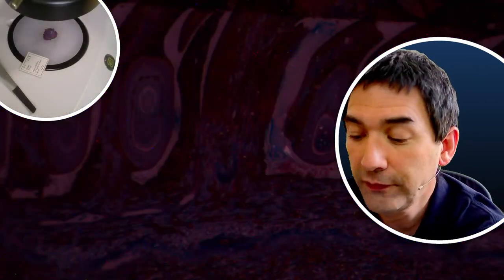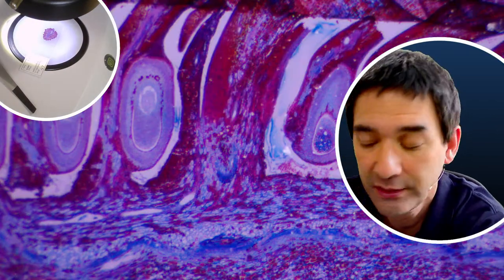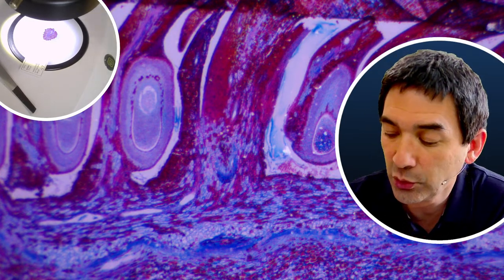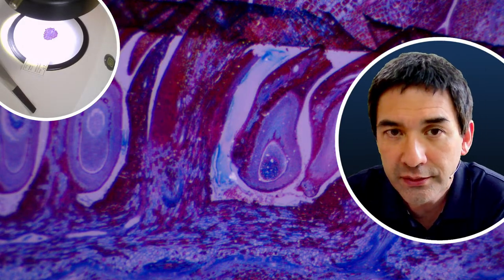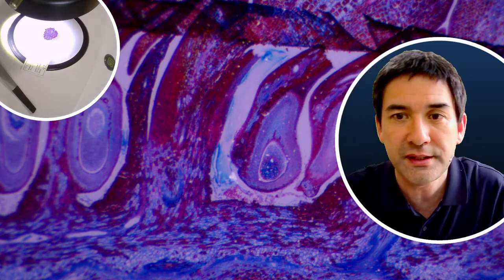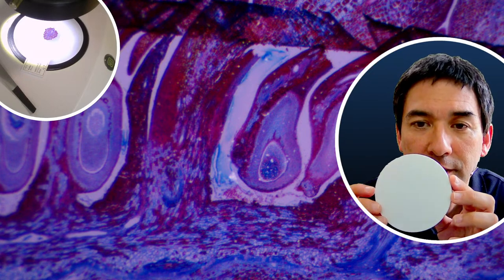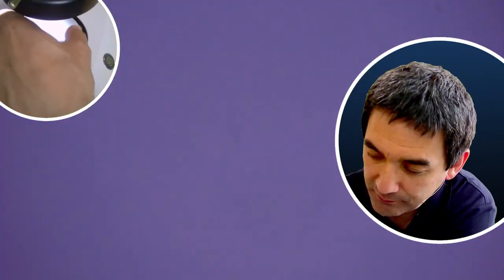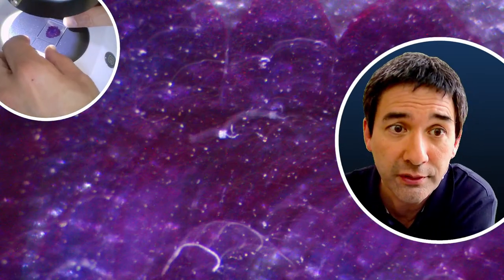The reason the top light seems to work on slides is because the light bounces through the slide and reflects from the bottom. Now I also have these plastic plates — using a black surface, you can see white dots which are dust and reflected light. When the bottom absorbs light because it's black, you're not able to see a lot. So these slides essentially still need light coming from the bottom. Some stereo microscopes only have light from the top — if that's the case and you use a black background, you're not able to observe slides.